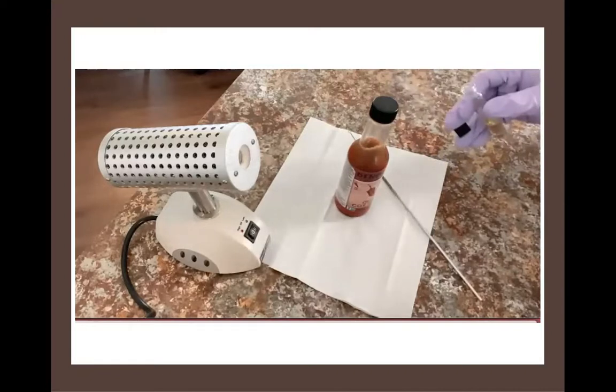Now, what does that achieve for me? The opening to the test tube is the place that's most vulnerable to a contaminating microbe falling in. My hands are up near the mouth of that tube when I'm taking the cap off. And of course, I'm also a source of contaminating microbes, even with gloves on. So by flaming that opening to the tube, I'm applying heat directly to the glass. So if there's any microbes right on the lip of that opening, I'm killing those.